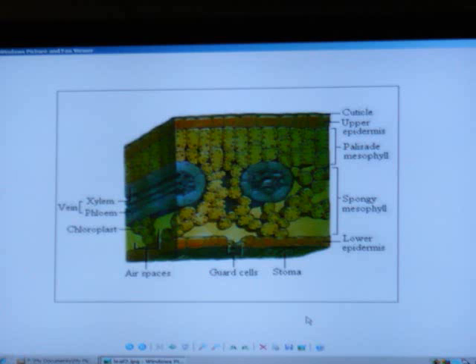And that second scope right there has a cross section in it of a pine leaf, a pine needle. It is beautiful. I like to have pictures like that I might put on my wall. It's so nice. But you'll see them later on. They're turned off right now. Oh, okay. But anyway, you'll see them. You're going to be drawing all of them in a minute.